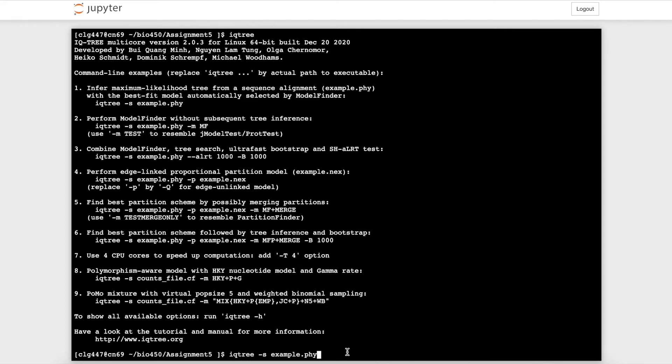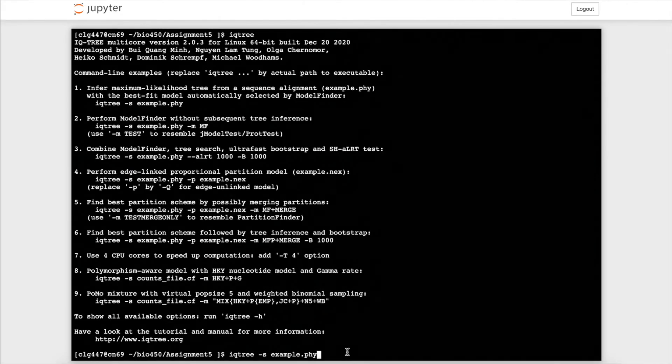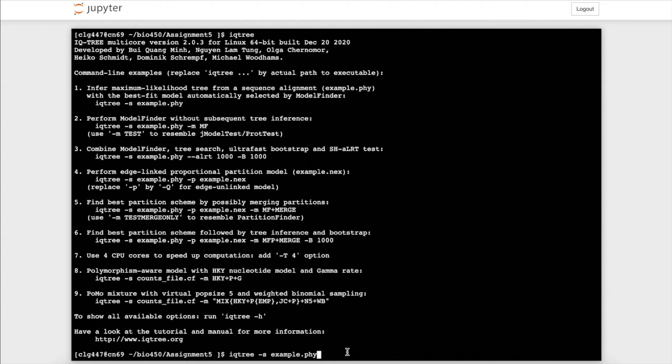IQ-Tree 2 is programmed to auto detect the sequence type and the best fitting substitution model, so the user doesn't have to worry about that unless they have a specific model they want to manually request. Now I will run the command by pressing command enter.